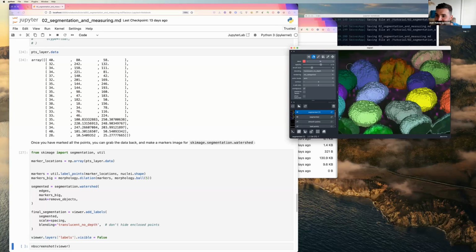I see the view changing. Oh, that's what's going on. It's because I had the two layers showing. Okay. All right, we're all good. Back to eraser. There you go. Okay. Yeah, so I was deleting one layer, not the other.